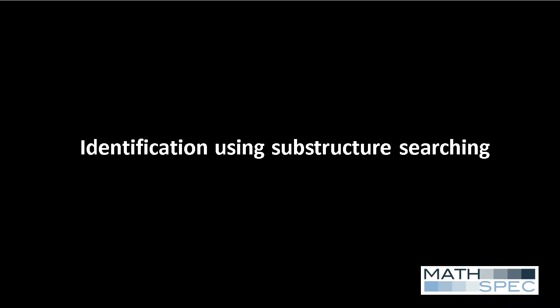In this video, I will demonstrate how our Excel add-in can help identify an unknown compound from its accurate mass and MSMS data by using substructure searching. Substructure searching is most useful when the unknown analyte that we wish to identify is a known compound that is probably found in the PubChem Compound database.